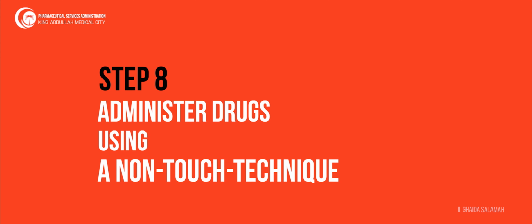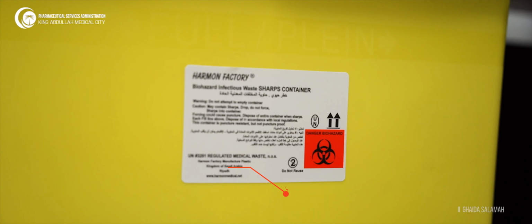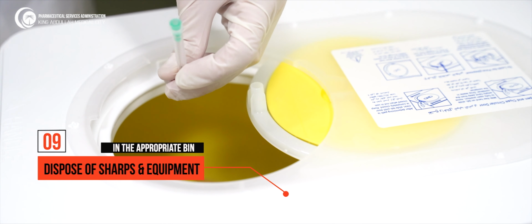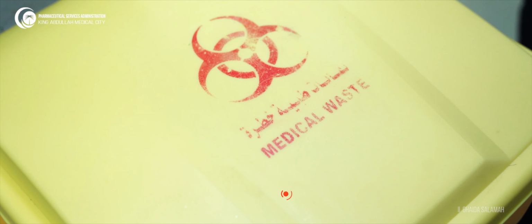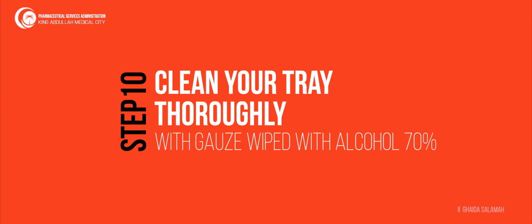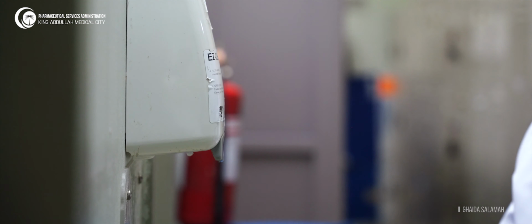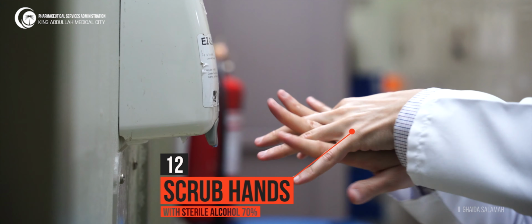Always avoid touching any critical parts. After you finish, you should dispose of all sharp equipment in the sharps container and any gloves or non-sharp equipment in the regular medical waste. After you finish, you should clean your tray again, dispose of your gloves, and scrub your hands using sterile alcohol 70%.